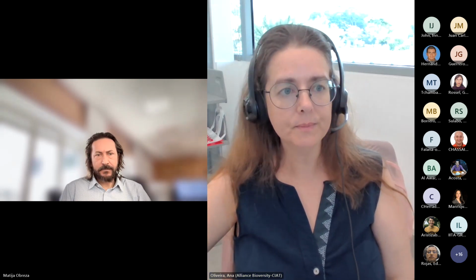Chamba, I hope it is useful. Yes, Alberto. Hello. Do you have a manual with all this information, step by step? Is there something like GGCE for Dummies or something like this?